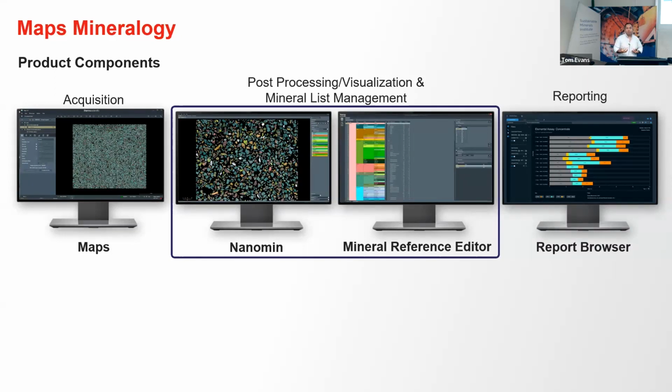Because that's one of the things when we're working with scanning electron microscopes: every time we increase the magnification, we want higher resolution images, but the area that we are analyzing gets smaller every time. And of course, we want to make sure that the results are representative. That's one of the main goals, right? That's why if we are analyzing particles, we want to analyze thousands or hundreds of thousands of particles to make sure it's statistically robust and representative of the sample. Or if you have a thin section, you might want to capture the whole thin section to capture the heterogeneity of the rock.